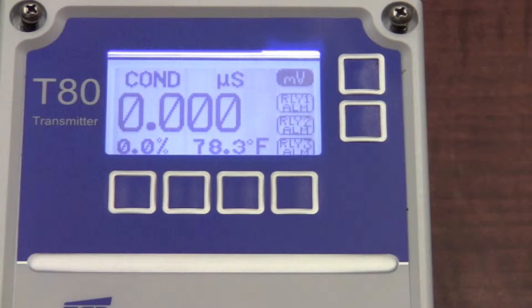The T80 can be purchased as a two-wire loop powered unit. It can be also line powered. When I say line, it could be AC or DC, and can have relays. When I do buy the line powered unit, I do get the back lighting on the display. It is an LCD display, which is very good in high intensity light areas as in outdoors. There's also a sun shield available for the T80.